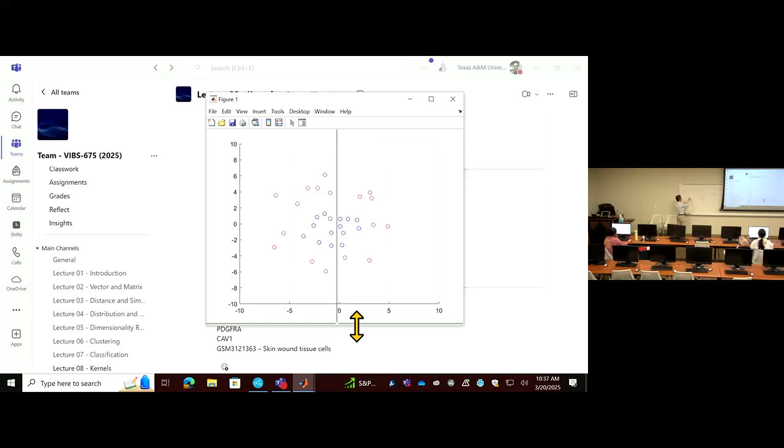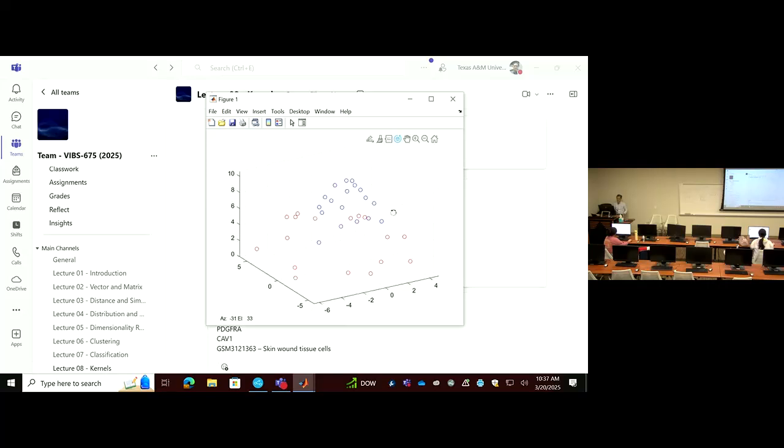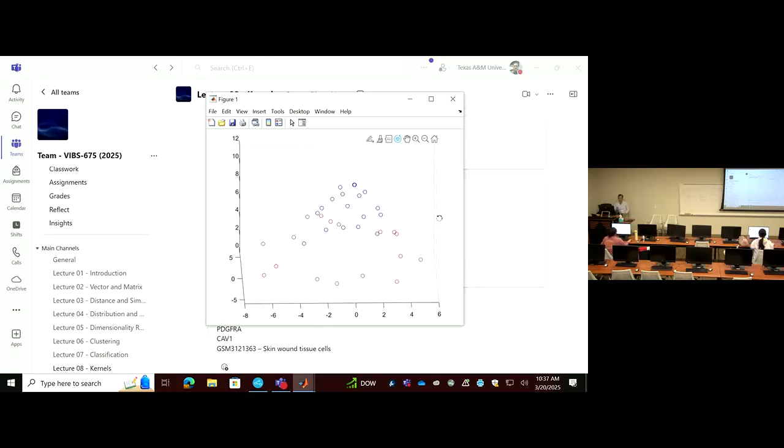And then you left click to start to point the blue points, then right click again. So basically left click to make points and stop using right click. And then start to left click to add more points in the middle, and right click to stop. That's all. This is a program that is set up. So once I finish my left click of the blue points, then right click to finish, then this program will transform this into 3D. And then you see the transformation allows you to separate the points afterwards.